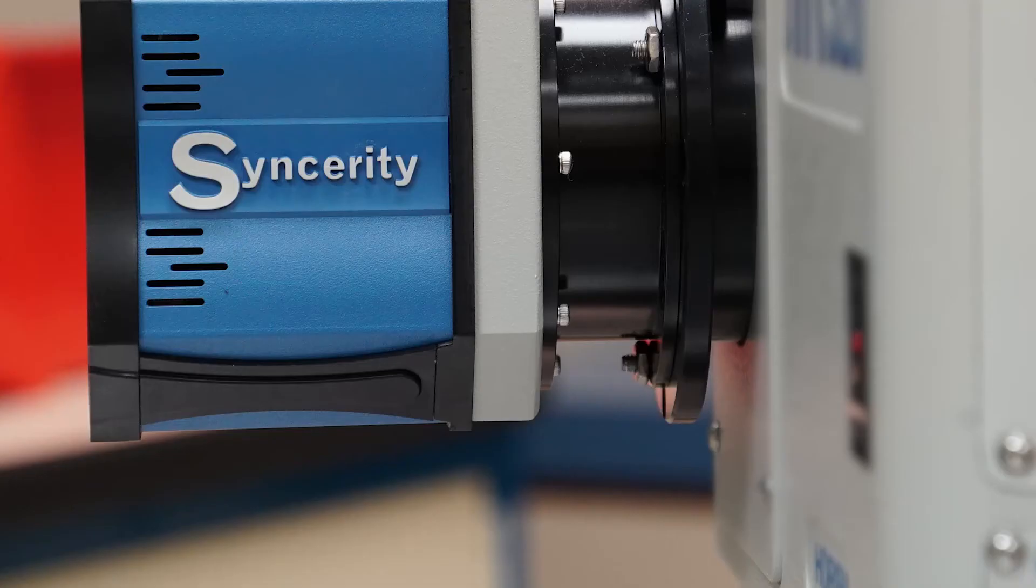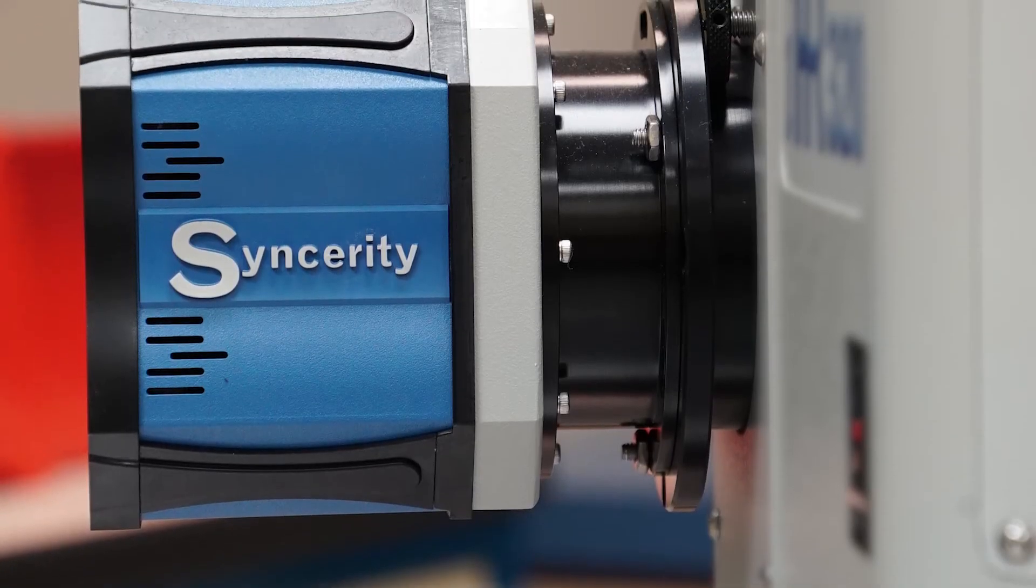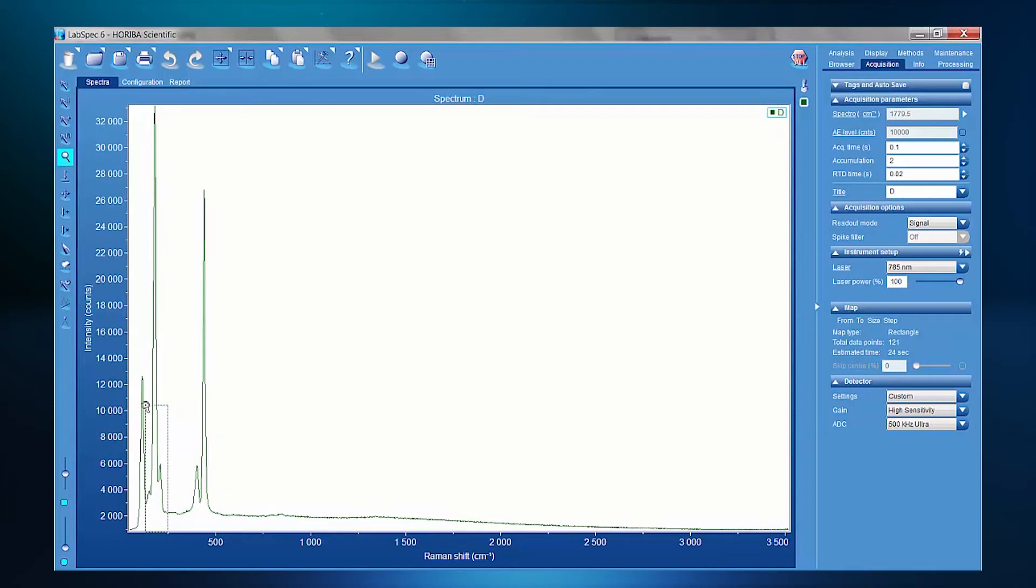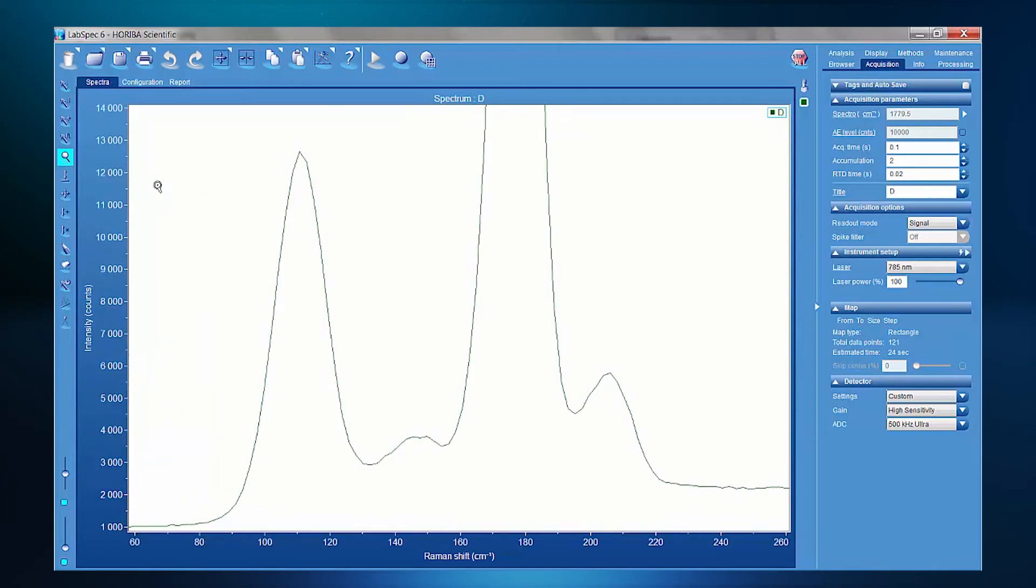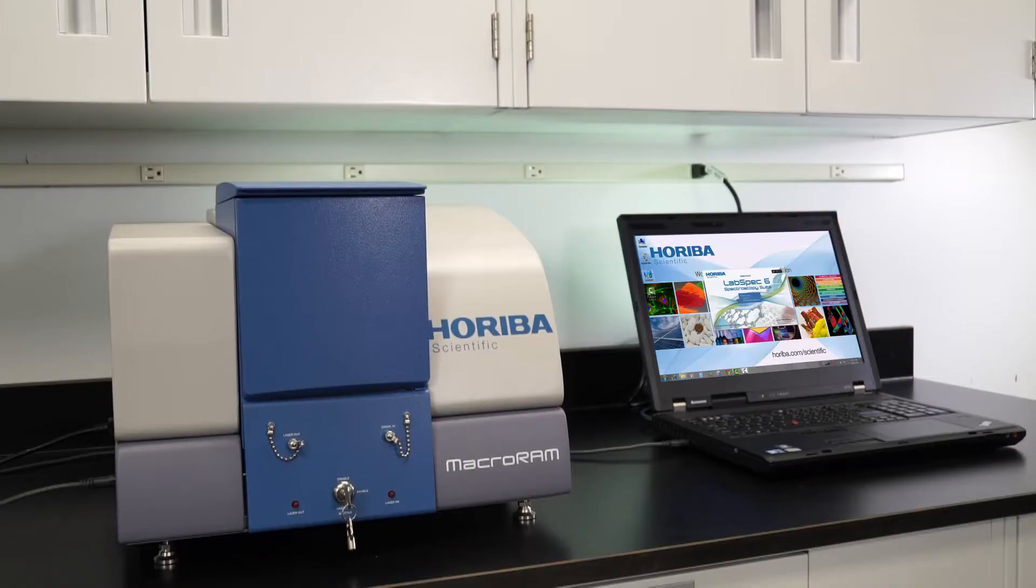Running with a deep-cooled back-illuminated CCD and high-quality Raman filters allow measurements to get incredibly close to the laser line with industry-leading wide-spectrum coverage.